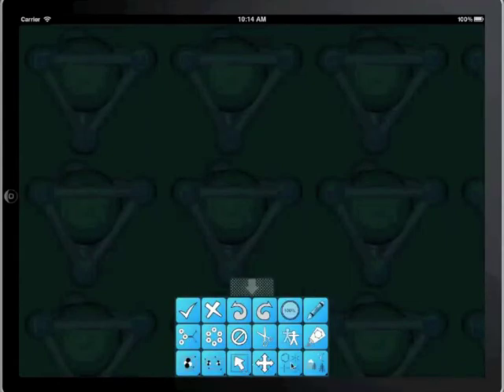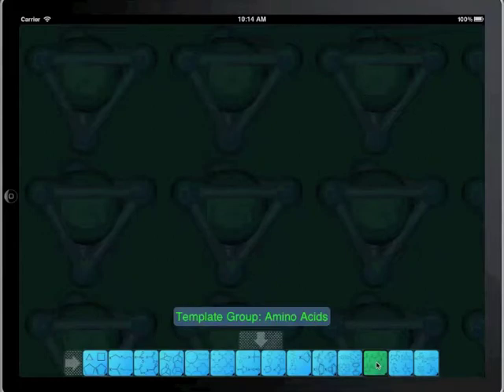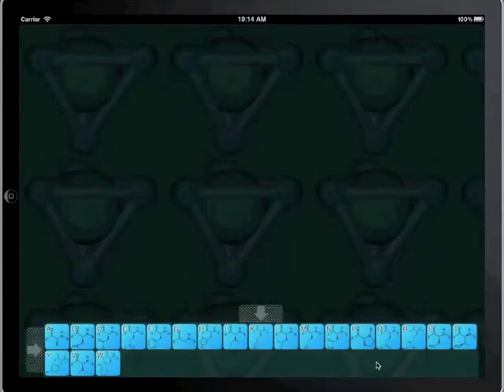First of all, open up the template menu and locate the peptides amino acid subgroup. As you can see, each of the naturally occurring amino acids are listed along with their single-letter code.